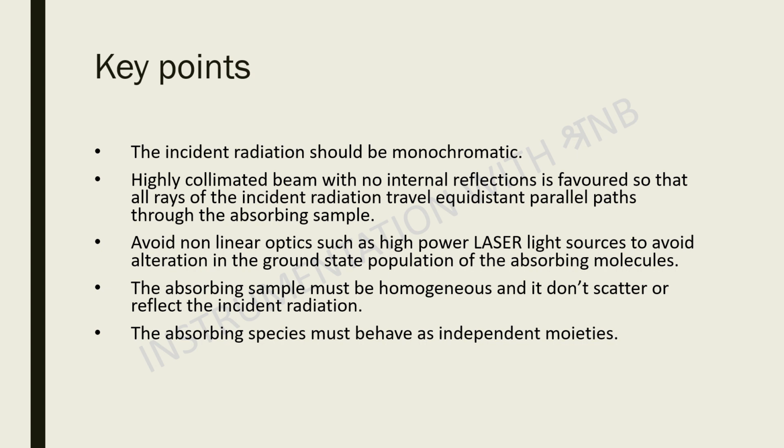The path of the radiation should be the same for all the absorbing species of the sample. Avoid non-linear optics such as a high-power laser light source to avoid alteration in the ground state population of the absorbing species. Next, the absorbing sample must be homogeneous and it should not scatter or reflect the incident radiation. No suspended particles should be there in the sample. The absorbing species must behave as independent moieties. I'll tell you this later.